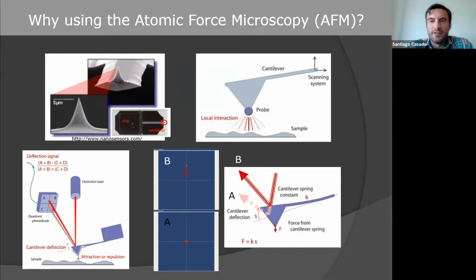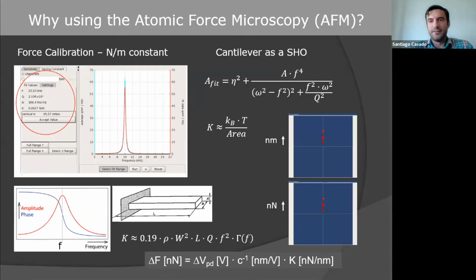If we want to check how structures are at the nanoscale, and we cannot see because basically the light interferes with itself at this scale, what do we do? There are different modes, as you know, but basically we are looking for different forces that affect the tip from the surface of the sample. Another important thing that the AFM provides is the control of the force. By this, we can touch these samples with an extremely controlled force that the tip applies on the sample. So this opens the possibility to measure very soft samples like biological ones.